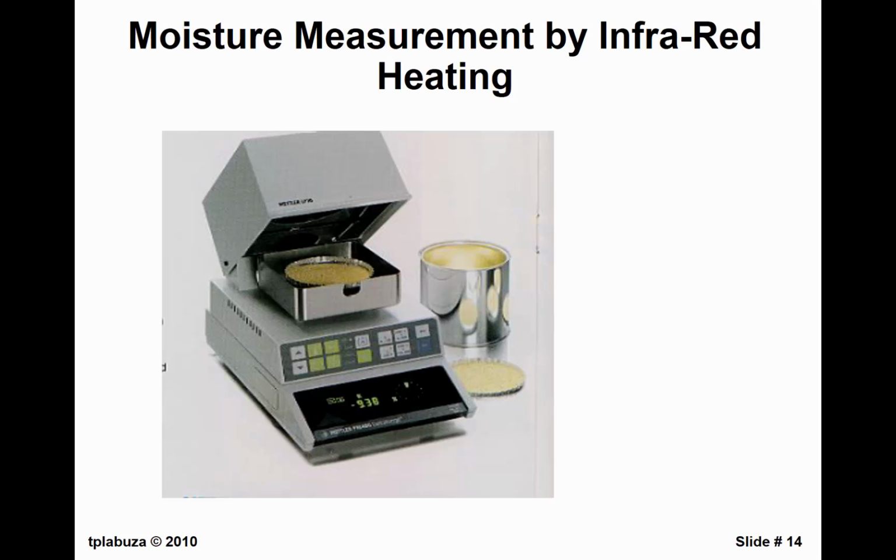If I'm out on the plant floor and I'm checking on, let's say, cookies coming out of a large, long, maybe 200 feet long baking oven, and the cookies are moving down there, you have as a control that it's got to be at a certain moisture because you don't want it either too crisp or too soggy. You're not going to wait the 5 to 15 hours using an oven, so you want something fast.